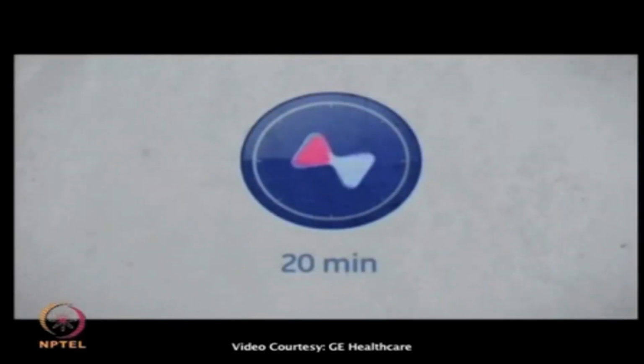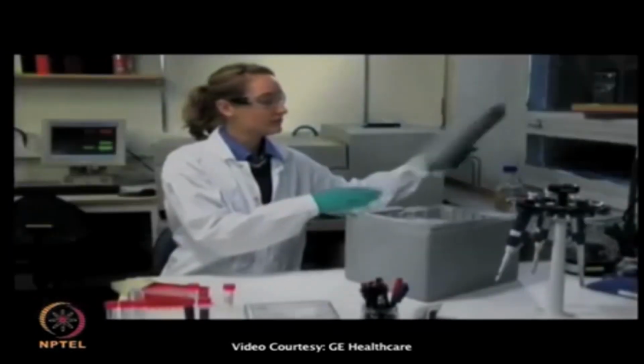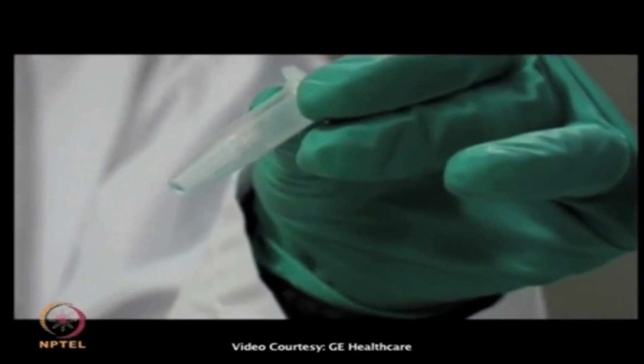The cells are incubated with CyDye DIGE Fluor minimal dyes for 20 minutes on ice in the dark. After the labeling reaction, the unreacted dye is quenched by adding 20 microliters of 10 millimolar lysine. The labeled cells are now washed twice in cold HBSS pH 7.4 buffer to remove the excess CyDye. There will therefore be no free dye left for unwanted intracellular labeling of proteins in the next step, which is cell lysis.